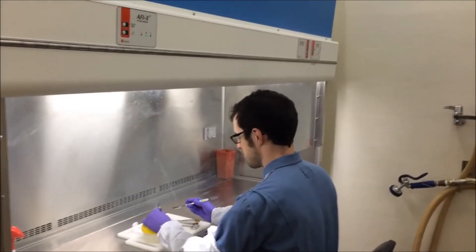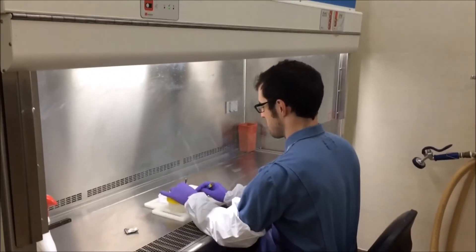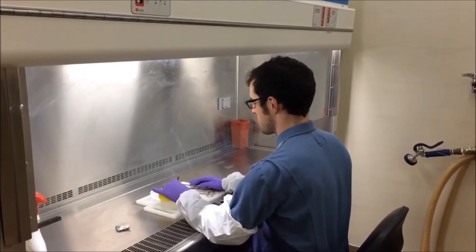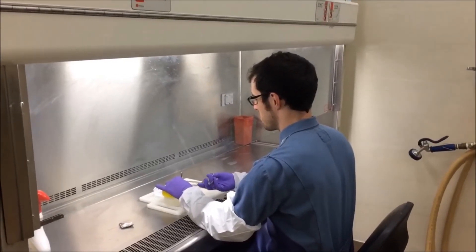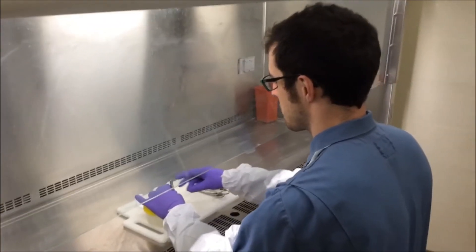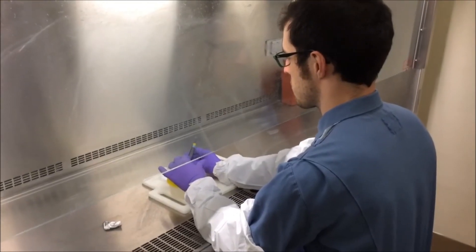While Dr. Scott works in the biosafety cabinet you can see that he is very careful to make sure that he remains underneath the biosafety cabinet so that everything is contained within it and he is clean outside. He's just going to be cutting and removing tissue and placing it into those small cassettes to then be placed into the fixative. So there you have it, that's what happens when a bat comes into Western Northern. We hope you enjoyed the video.